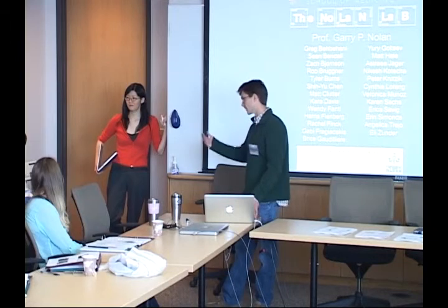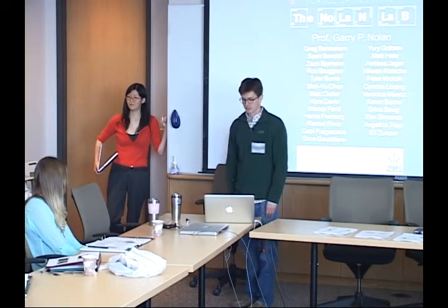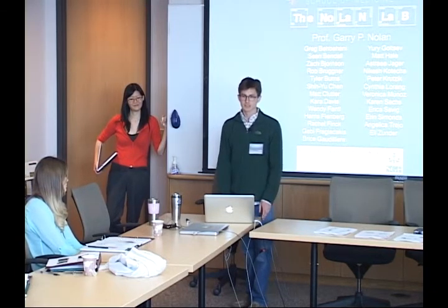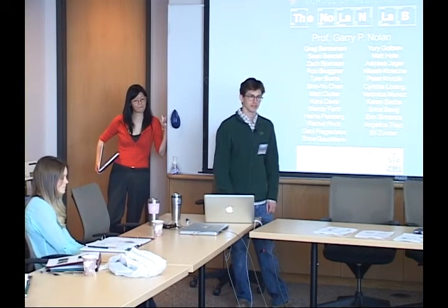Yeah. Sigma, because it's monoisotopic. Yeah, I was just made aware of that pretty recently, so we haven't done a ton of troubleshooting, but hopefully we'll figure it out. Yeah. And affinity purified polyclonal antibody could also work in theory? Could definitely work, yeah. Generally, we stick to labeling IgGs.